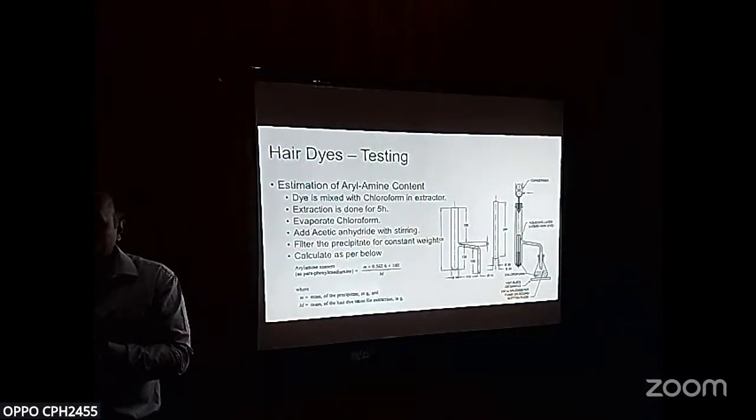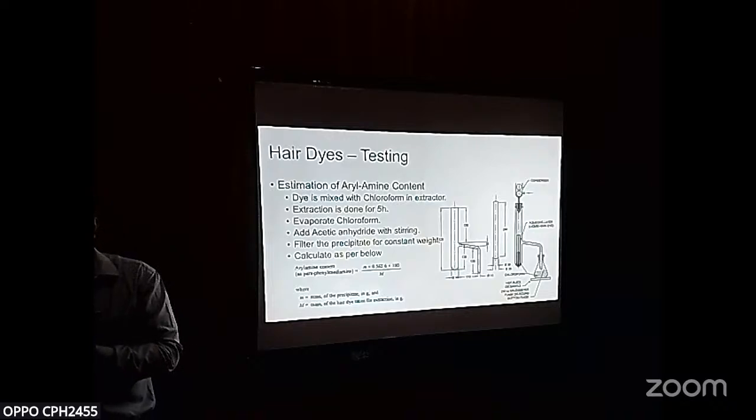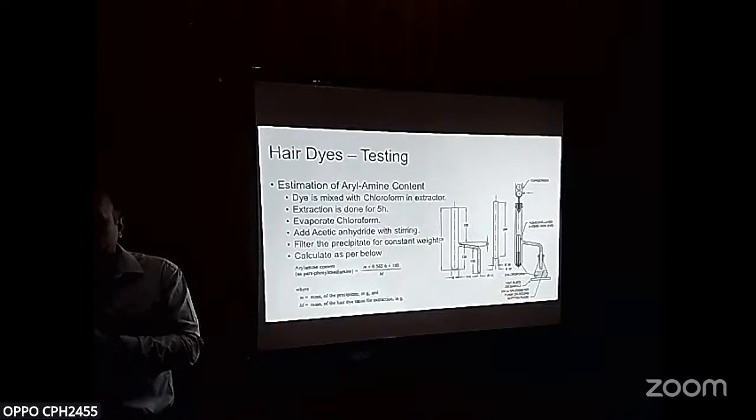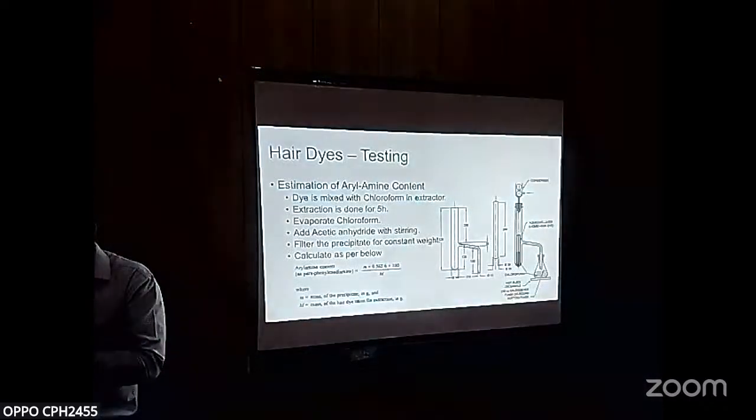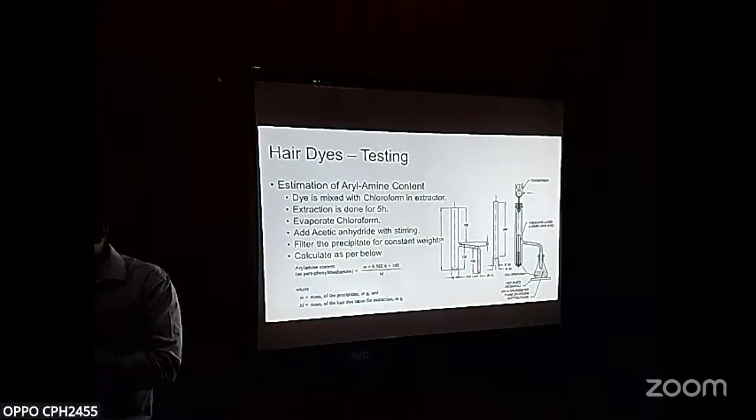So when you are analyzing a hair dye shampoo or a hair coloring shampoo, these parameters will be a bit of a challenge, wherein the developer will be pre-mixed. Extracting the dye and the developer separately will be a very big challenge for the industry. That was about it. And this equipment can be easily fabricated by units. Fine.